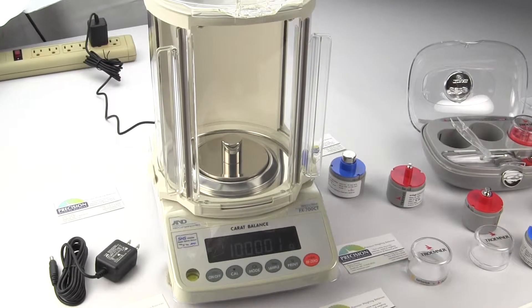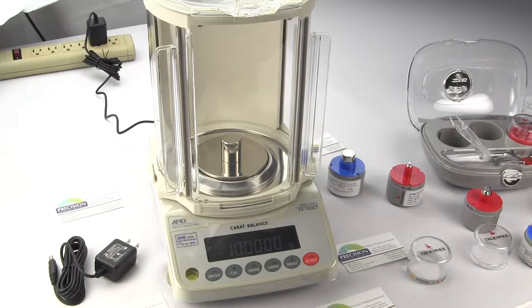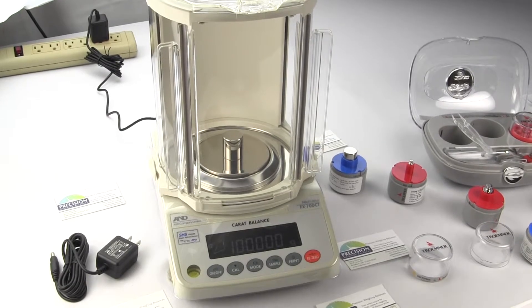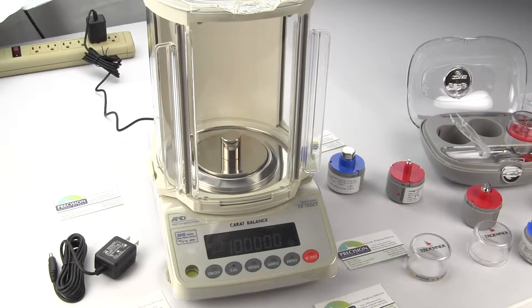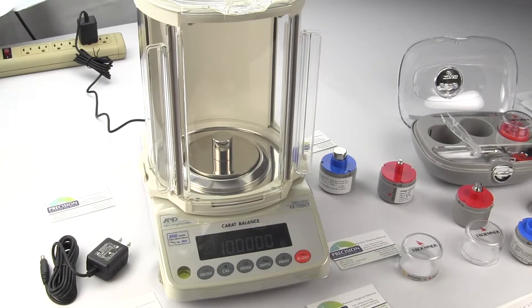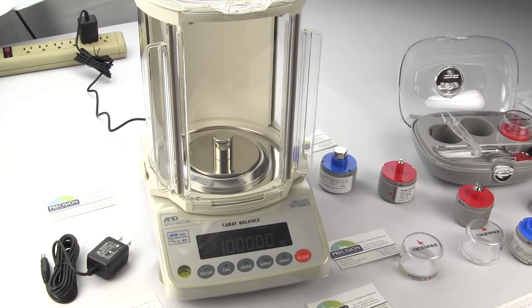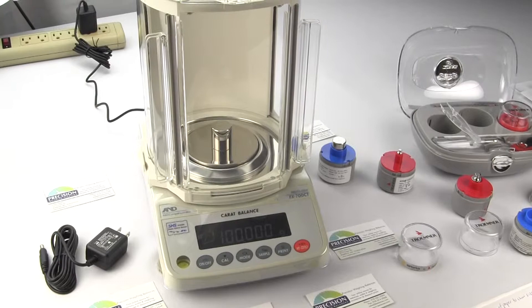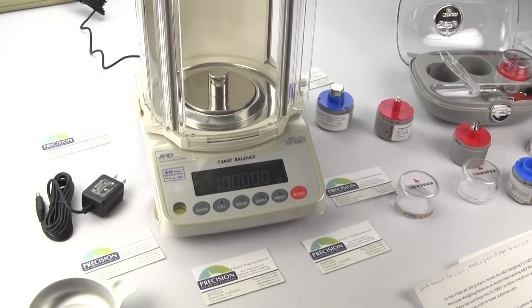In this video we will be reviewing the A&D FX700CT balance. We are Precision Weighing Balances and we are an authorized stocking dealer. You can order this balance at either one of our websites balances.com or scaleman.com.